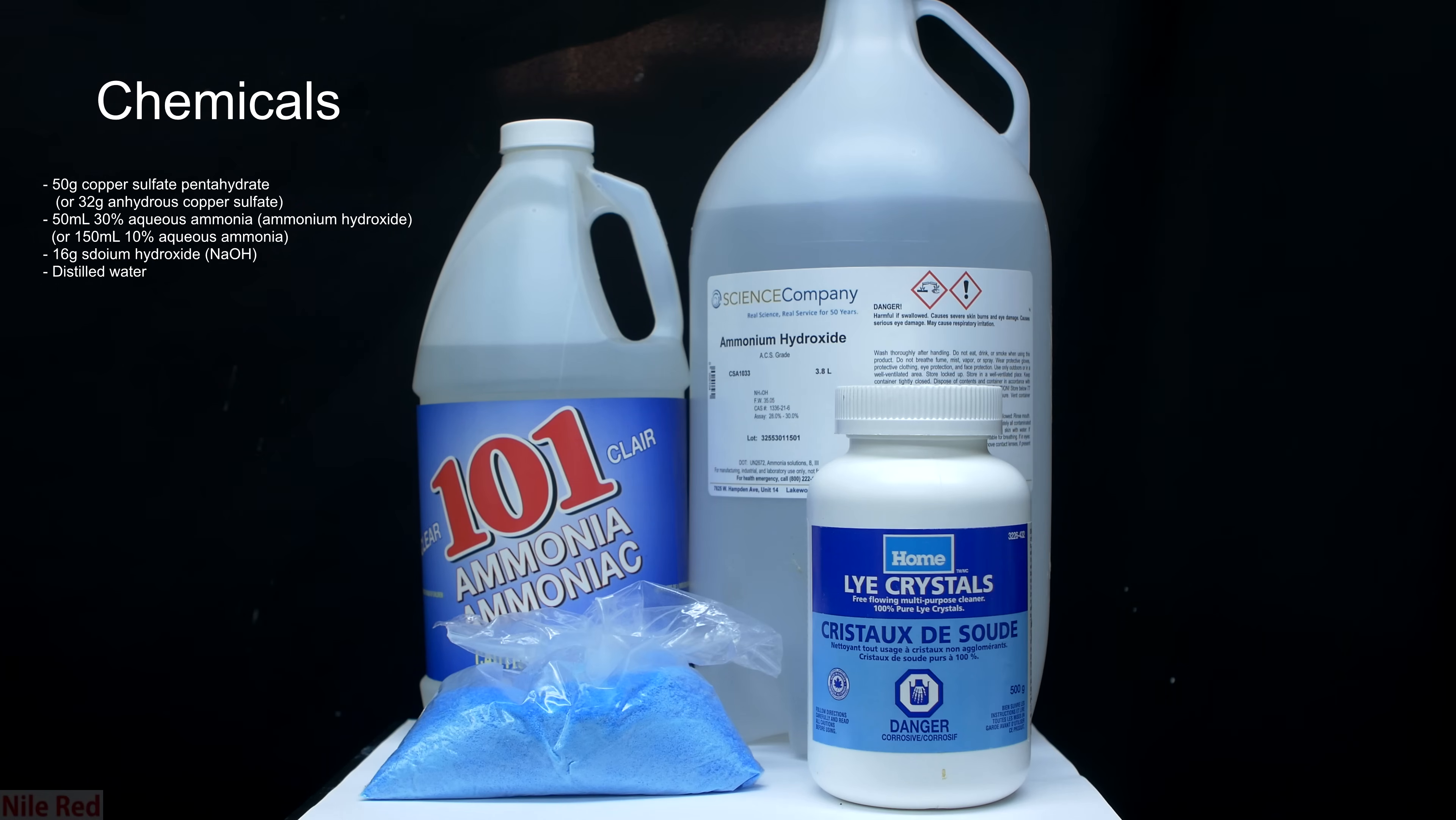Now for the other ingredients, they're pretty basic. At the bottom left we have our copper sulfate pentahydrate, and at the bottom right we have some sodium hydroxide. I bought the copper sulfate from eBay, but it can also be found in some stores as stump remover, and the sodium hydroxide is sold as drain cleaner.